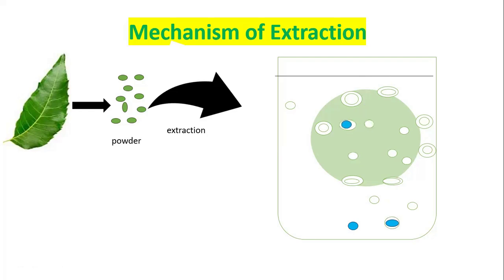Okay, and that should pass outside. In this way, all the active chemical components from the powder material, we can see that residue becomes outside. Just see here, as you add some additional quantity of the powder, the active chemical components come outside of the cell. Okay, so when you filter, you get the dissolved active chemical component. So this is the simple mechanism of the extraction.